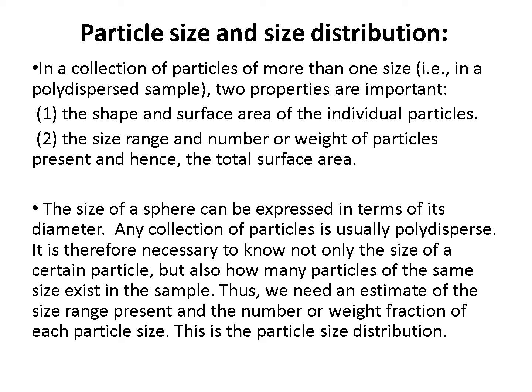So we have to determine particle size and particle size distribution.